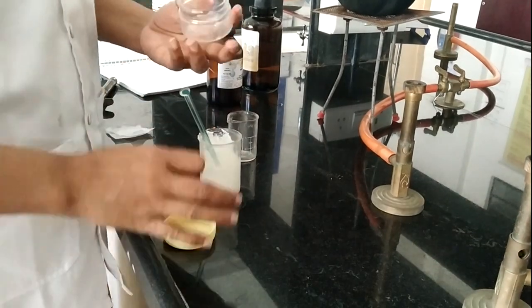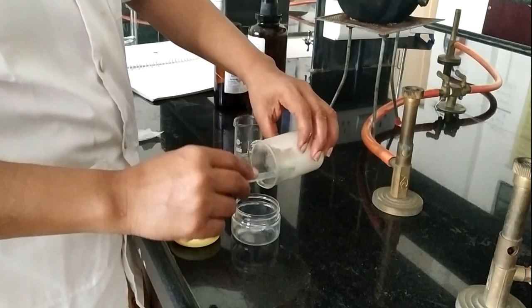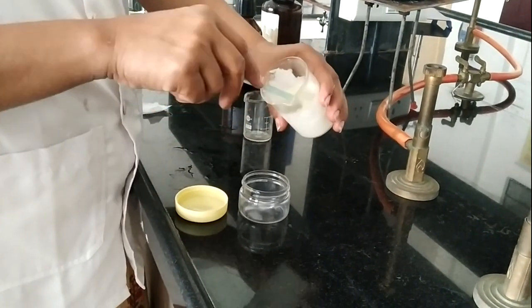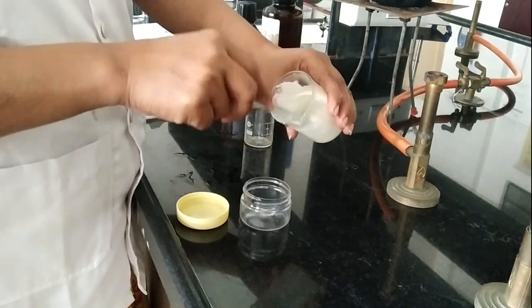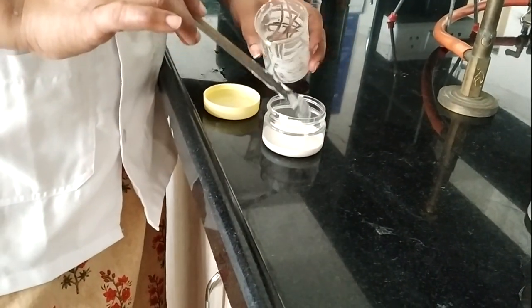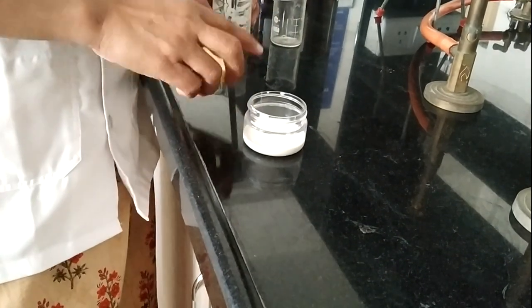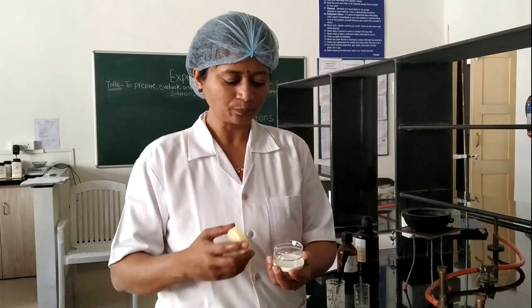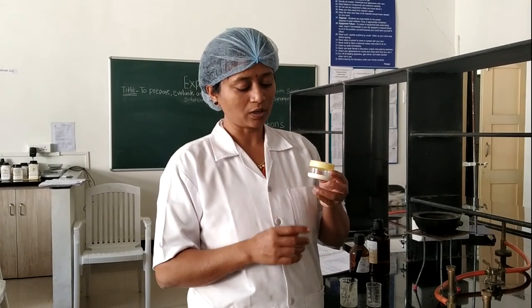Finally, we transfer our cream into the final container. In this way, we submit the cream into the wide mouth bottle, and our cream is white. See here, the appearance is white, and it has less grittiness and is easily washable. Its pH is between 5 to 7. In this way, we finish, and our vanishing cream is ready.